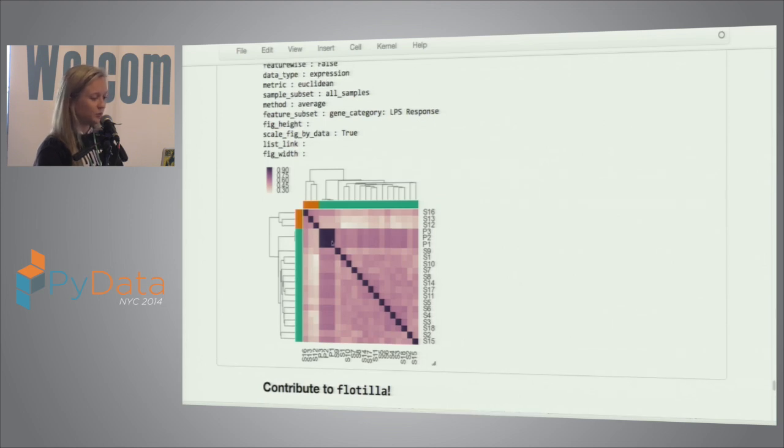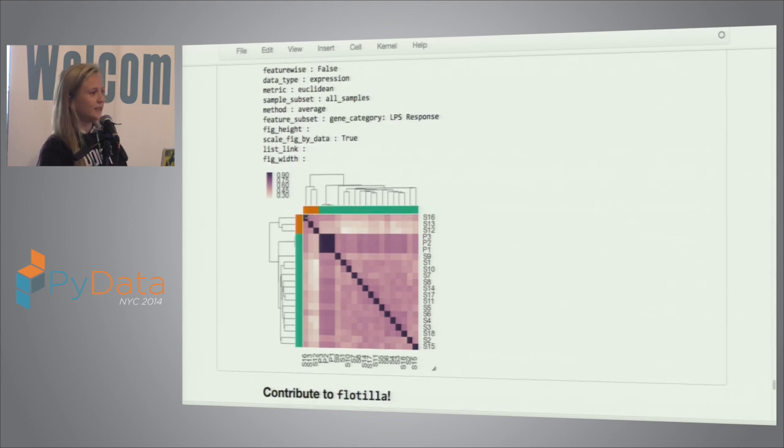And again, you see how these pooled samples are way more similar and how S16, S13, and S12 all keep clustering together. So these are many different ways of viewing the same thing, that these three samples are really different. And this allows you to explore your data and find different ways of proving the same point.